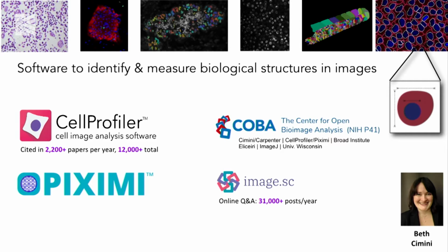This research is where I started my career and now is being taken on by a former alum of the group, Dr. Beth Cimini. Her lab now focuses on some of the things that we've started together. This includes CellProfiler, which is this open source software. The new generation, Piximi, is based on deep learning, which allows classification and eventually will allow segmentation as well. And this work is happening because of this lovely NIH center that funds it.